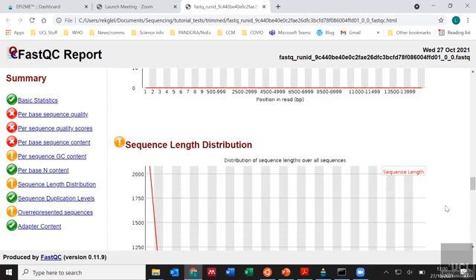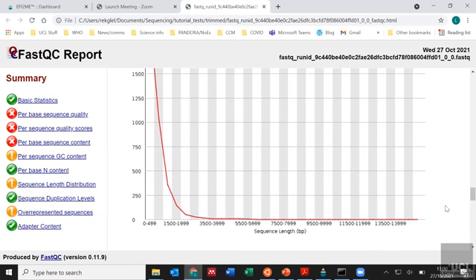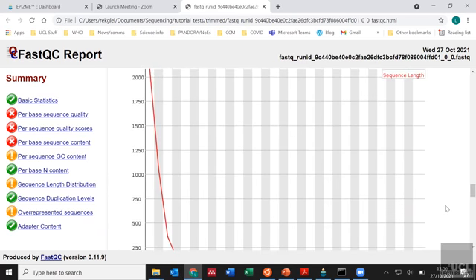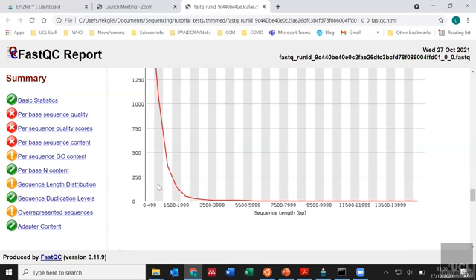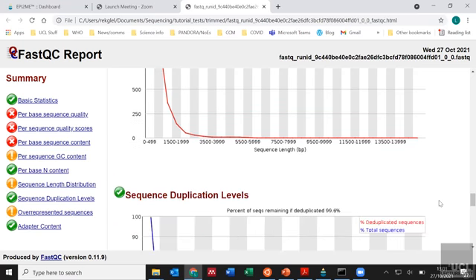And here you can see the length distribution. As I mentioned, because it's native DNA, we've got lots that are really small, but actually we've still got some that are going well up to about 15,000 base pairs. And if you had, as I said, PCR-based and your lengths were roughly about, say, 4,000, you would get more of a normal bell curve at around 4,000. So that entirely depends on what it is that you've sequenced.